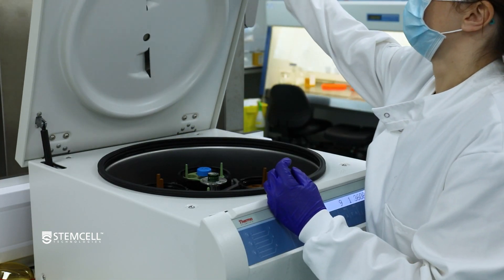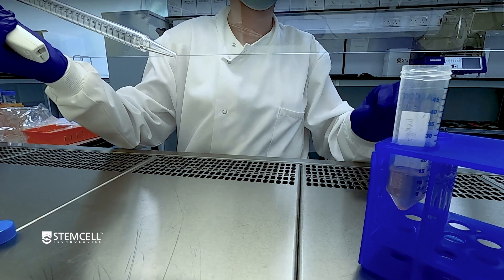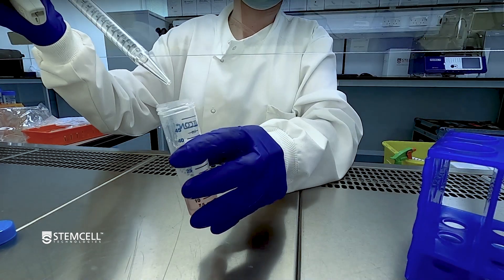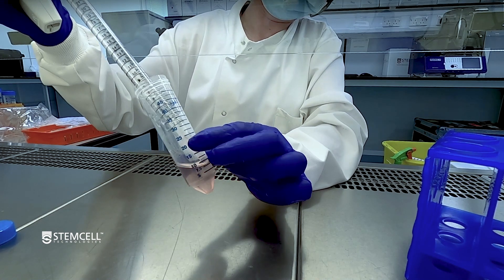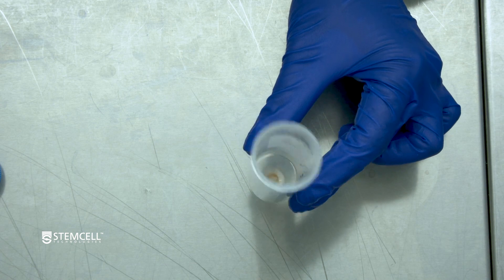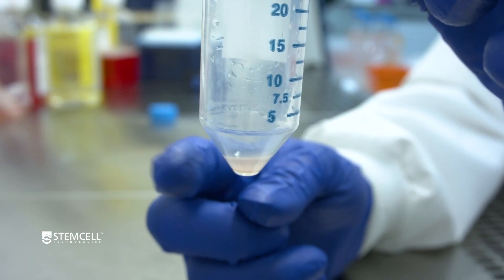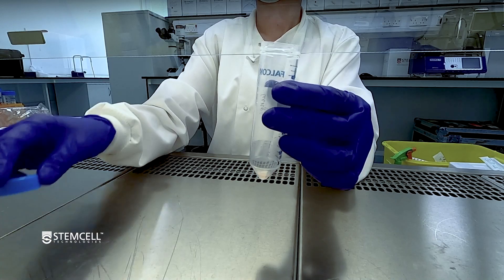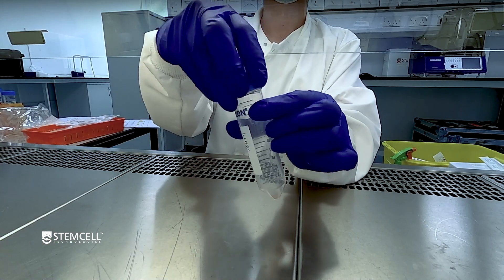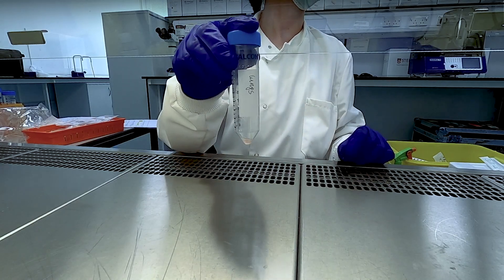Centrifuge at 300 times G for 10 minutes at room temperature with the brake on low. Carefully remove and discard the supernatant. Gently tap the tube to dissociate the cell pellet. You now have a single cell suspension that is ready for cell counting and downstream cell isolation. For more information, visit StemCell.com.